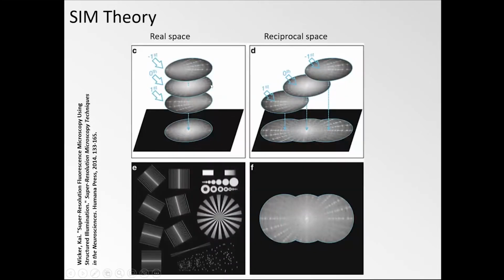But interestingly, if you look here at the top left, what goes through is essentially what normally goes through, plus two displaced copies. So information that actually belongs somewhere else. You can see some of these spokes radiate out, whereas in the DC component, or the normal component, you can see with the microscope, you wouldn't get those.